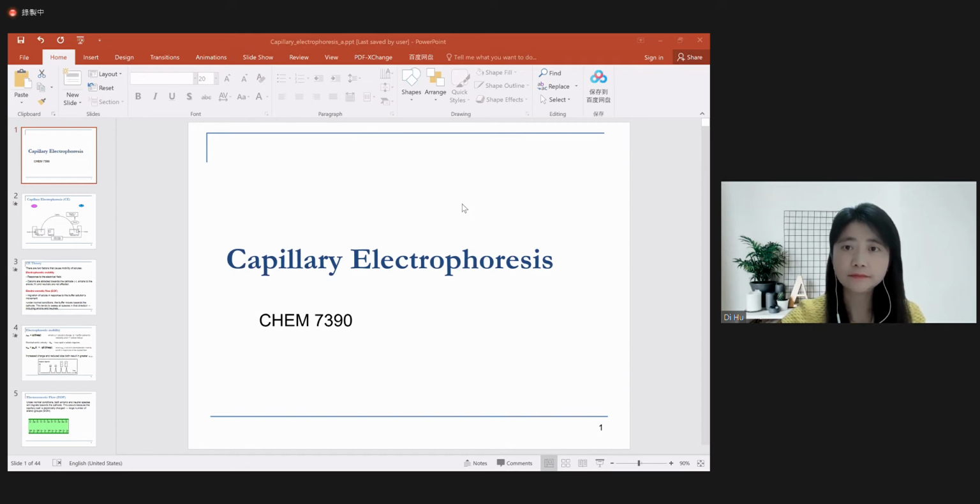Okay. Actually, today is the last part we need to cover in this separation science course, and today we're going to focus on capillary electrophoresis.